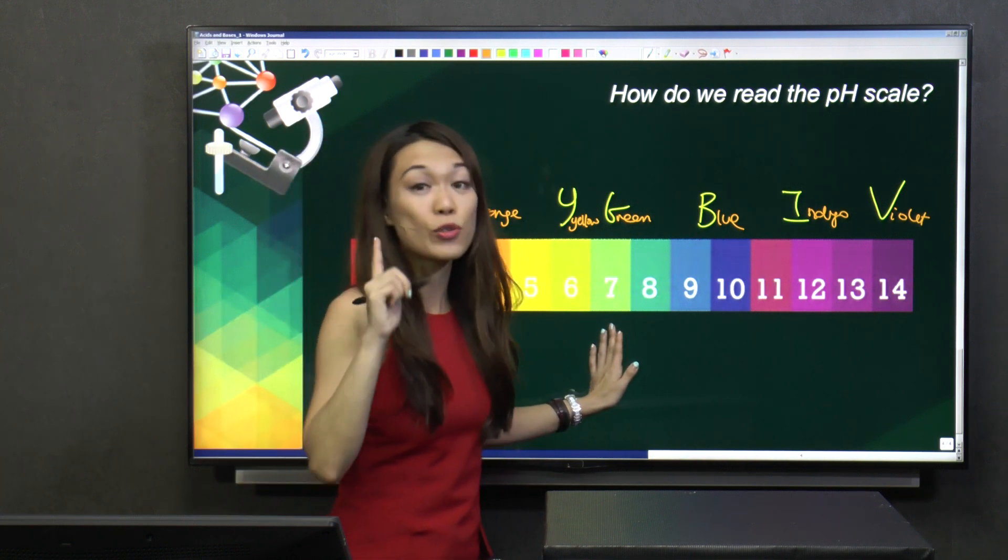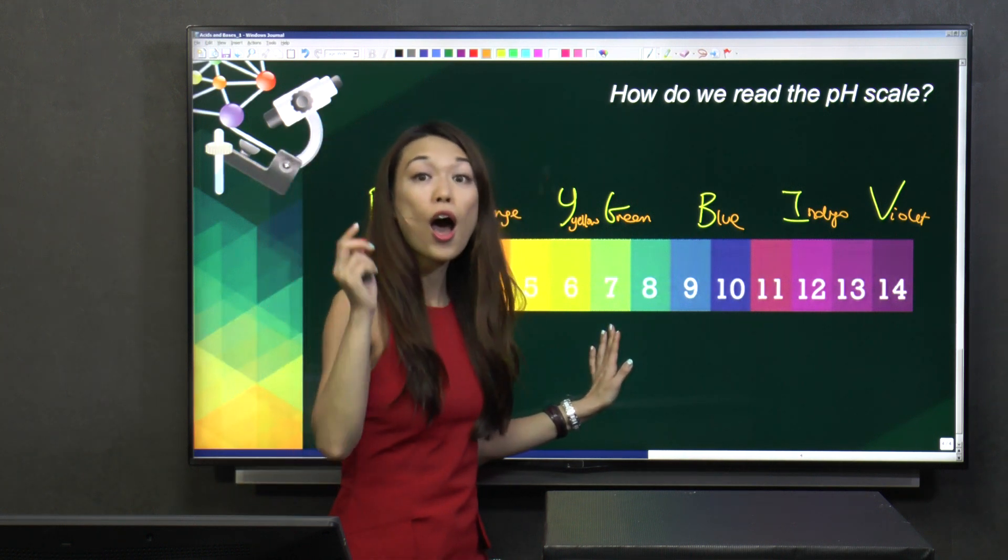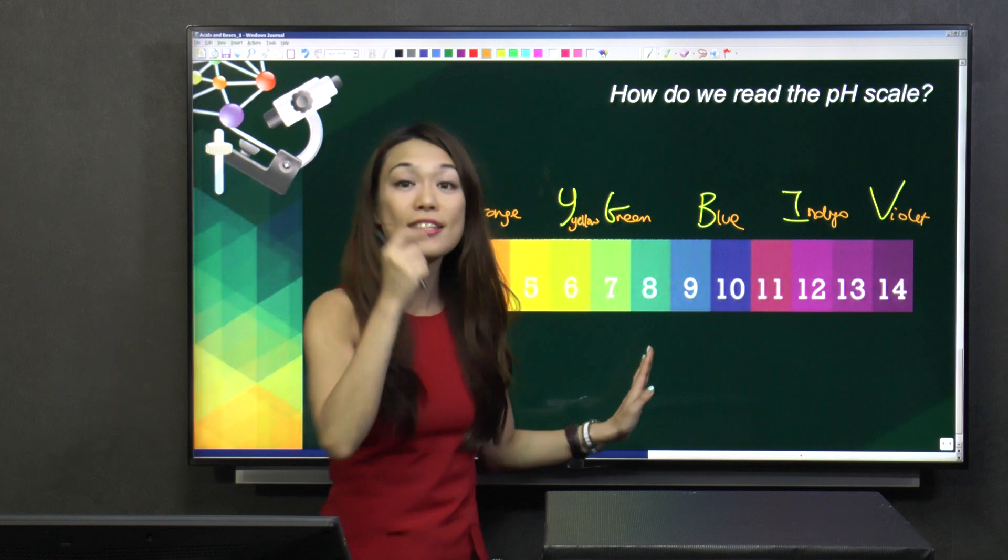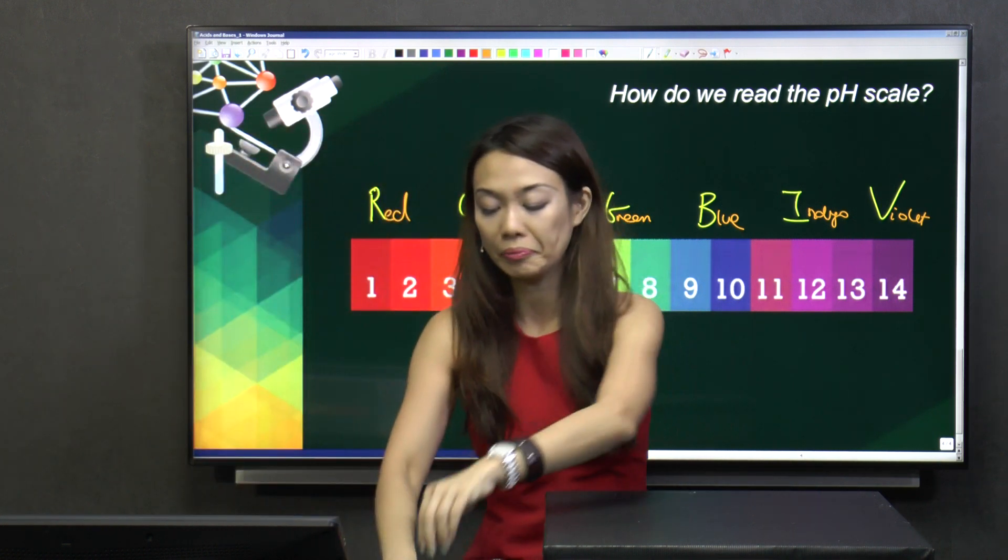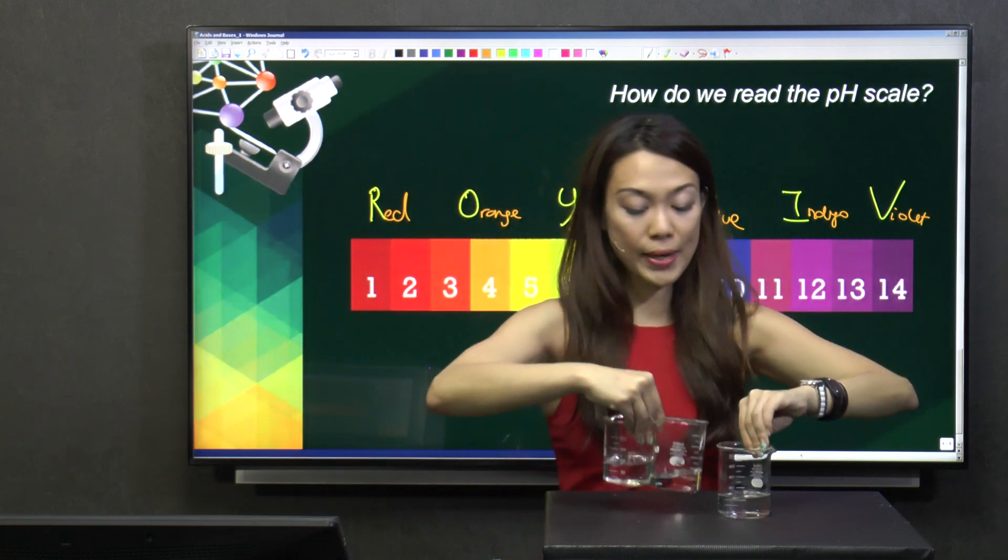Now, what things is green in colour, which is neutral? Think about it, it's the distilled water that you drink. So, I have with me here three beakers.